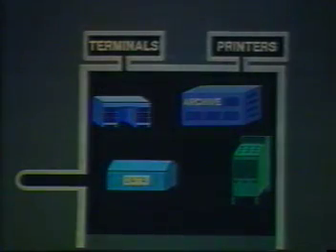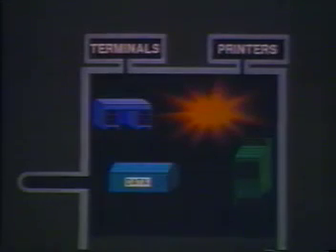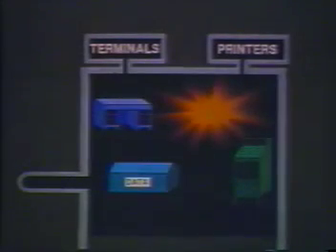The archive is not used directly in running experiments, so for now we will move it off screen to make room for the final and most unique element of the FACS Desk microworld, the Magic Secretary. Every FACS Desk user is granted a part-time interest in this secretary. It serves as your hands, eyes, and voice inside the computer.